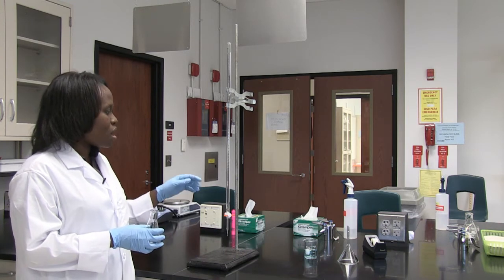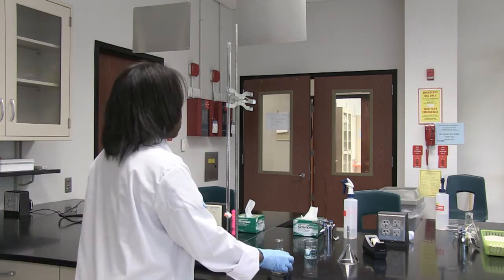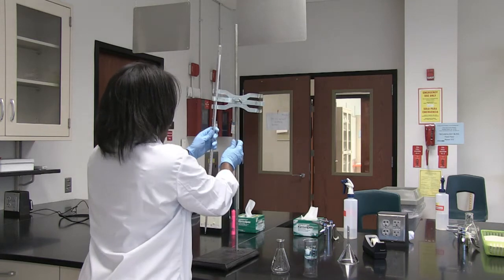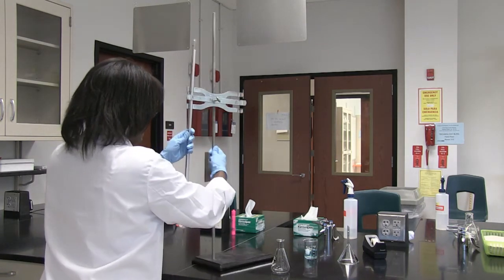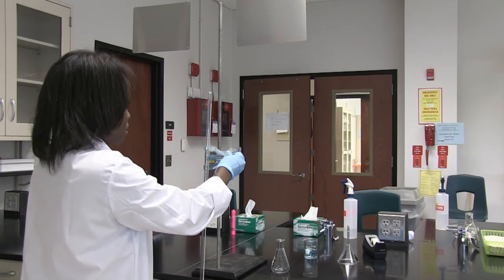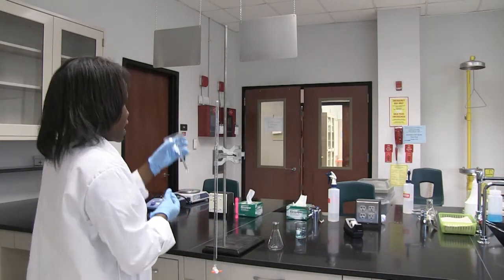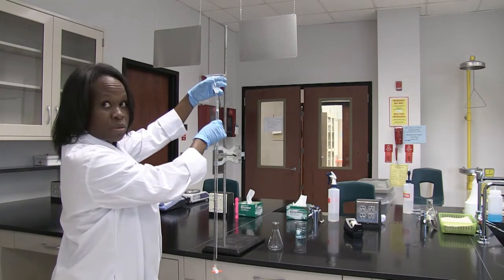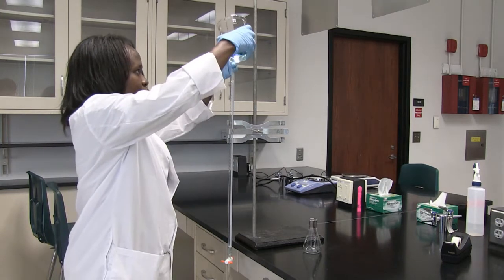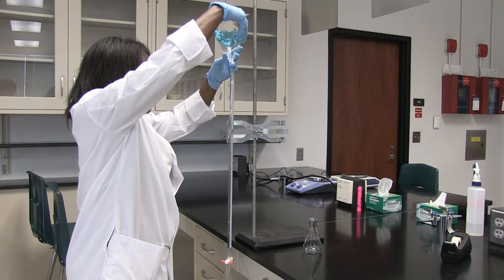So this morning I'm just going to show you how to add a specific volume of liquid to this Erlenmeyer flask for accurate measurement. So first, what we're going to do is adjust the burette so that I can add my liquid to the burette. I want to bring it down as much as possible so that I can add the liquid using a funnel, accurately and without spilling. And I'm going to fill it to this 20 mil mark. I'm going to add it gently so that I can minimize spilling of the liquid.